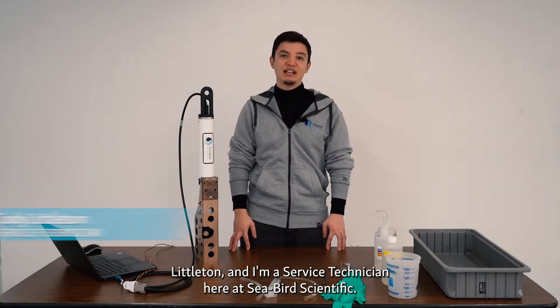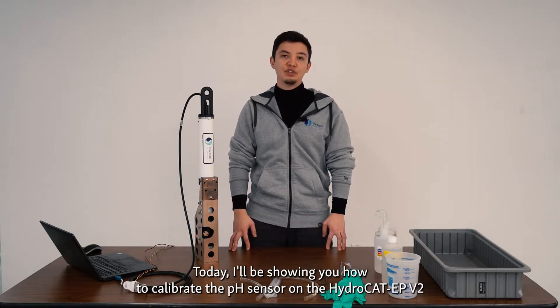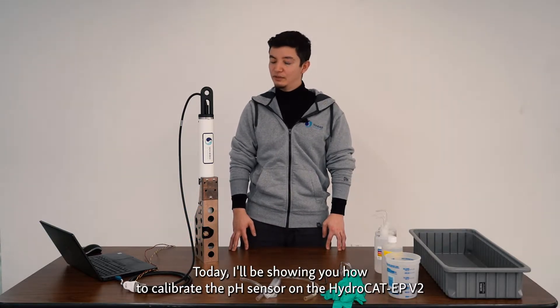Hello there, my name is Cody Littleton and I'm a Service Technician here at Seabird Scientific. Today I'll be showing you how to calibrate the pH sensor on the HydroCAD EP-V2.